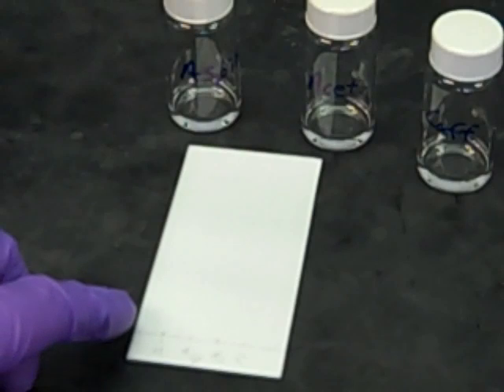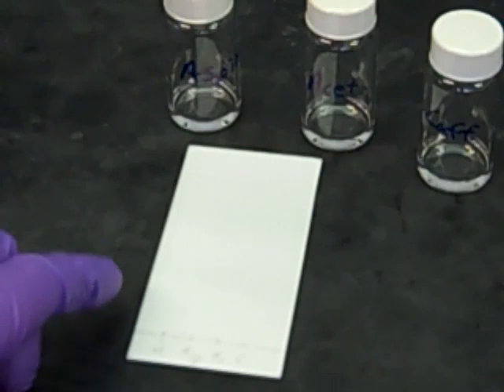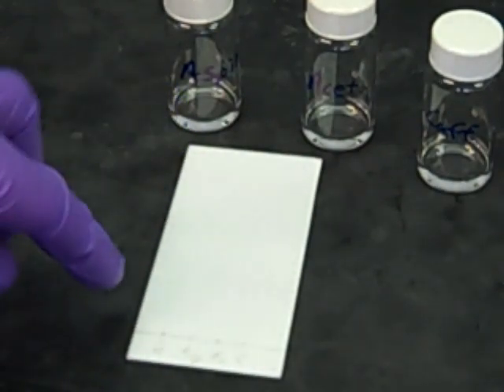You have to be aware of the amount of material you put on. If it's not enough, you won't see it. If it's too much, it'll overload the plate and make it difficult to run smoothly.